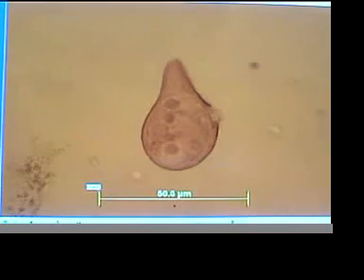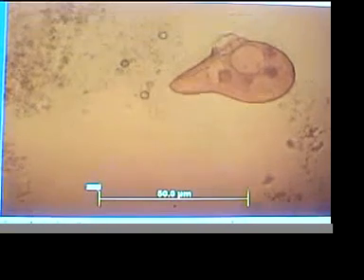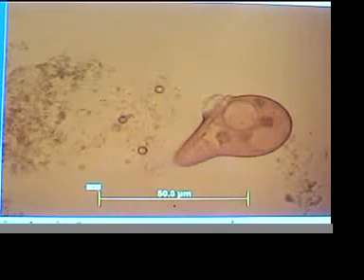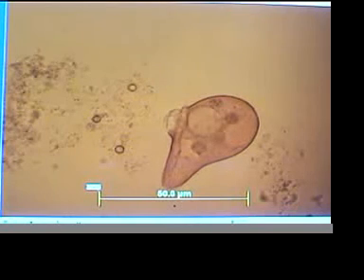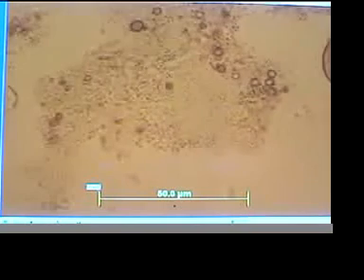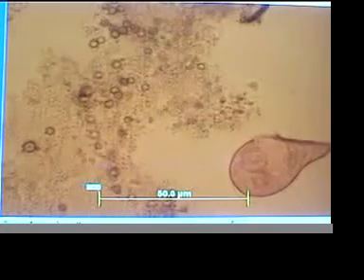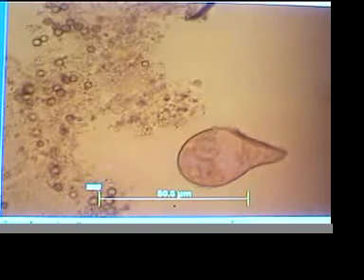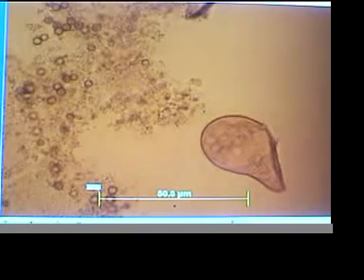And if we go up to 7H, we have this guy. Still hanging in there. And also in 7H is this guy. Hang on, we'll get him. He's in 7H also. These guys are getting pretty round looking.